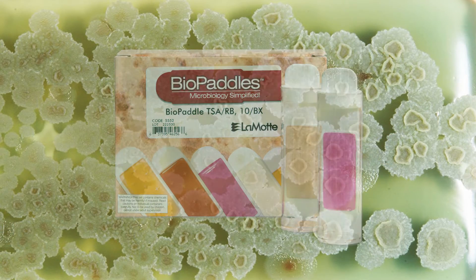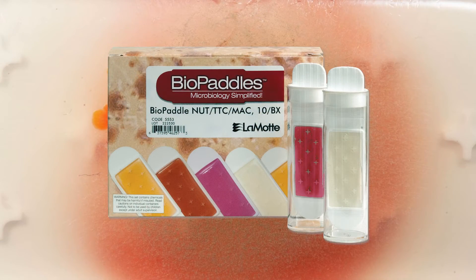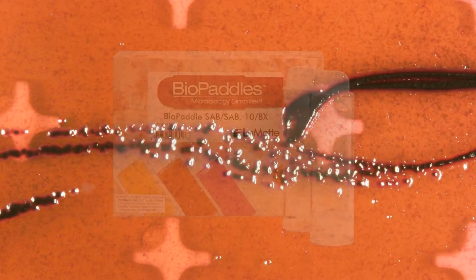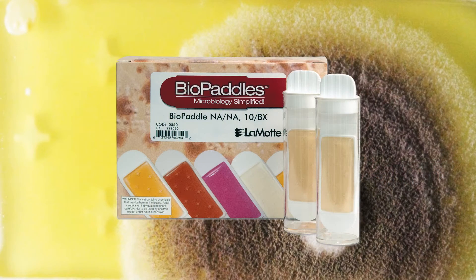In general, incubate at 35 degrees Celsius for 24 to 48 hours. For educational purposes, paddles used to sample non-coliform bacteria and fungi may be incubated at room temperature. Incubation may take 3 to 5 days.